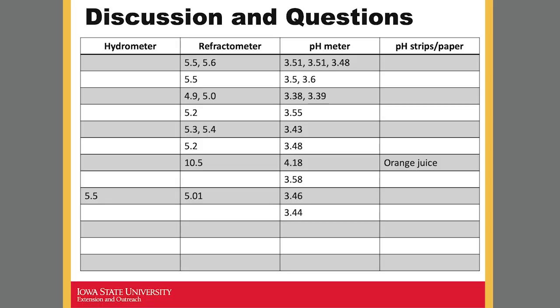And again, the measurement of Brix is all the solids that are dissolved. So if we just consider it based on the total sugars, it might be a little bit off. But if we look at total carbohydrates, again, we don't really have a measurement of acidity on the label or acid content, but it should be close, and it looks like it is.